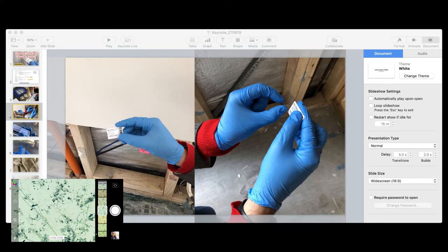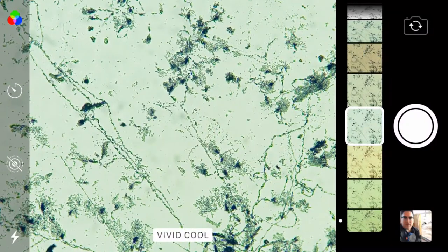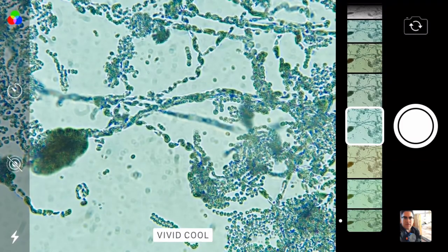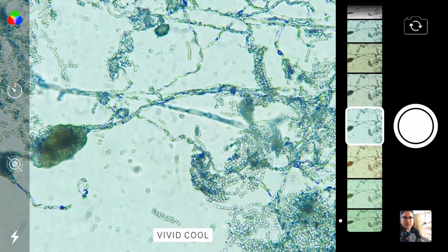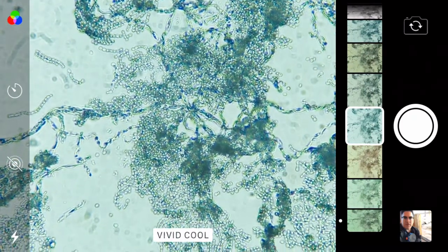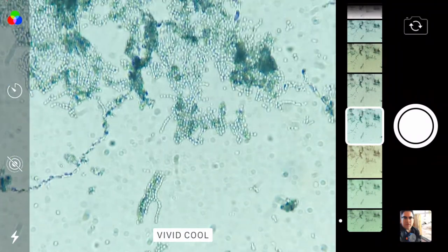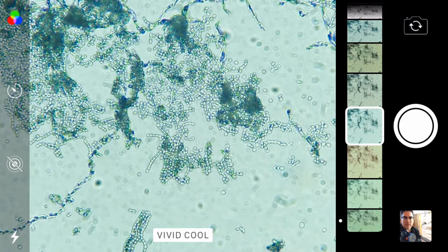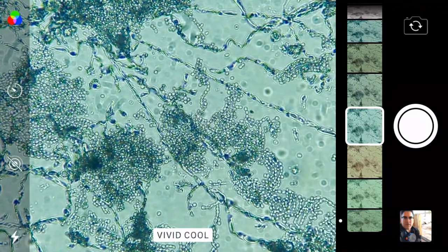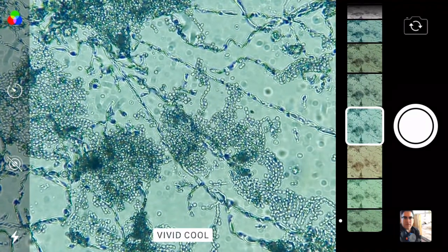Water came down from the top of the dwelling. When we take tape lifts—this is at 100 times magnification—zooming up to 400 times magnification, you start to see mould spores and chains of fungi very clearly. If this hadn't been tested, this lady's property would essentially have been plastered over and all of this mould would have been hidden in her walls.